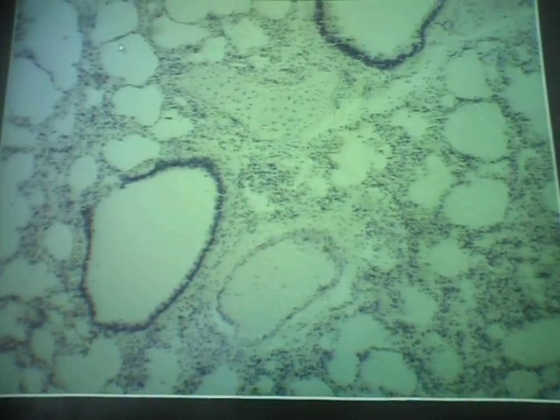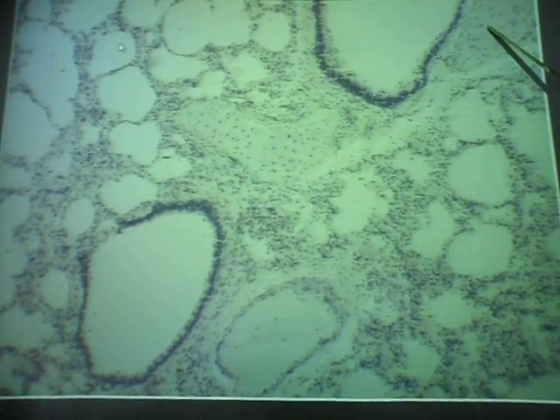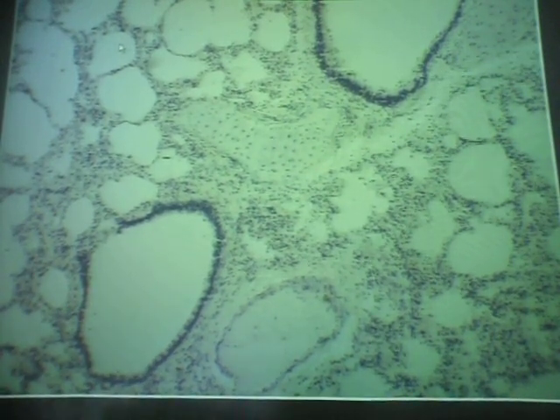And here again was the original one we looked at, the tertiary bronchus up here. See, there's a piece of cartilage there. There's one right there. We saw more as we went around the wall.